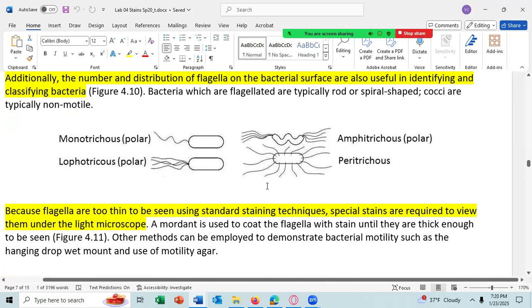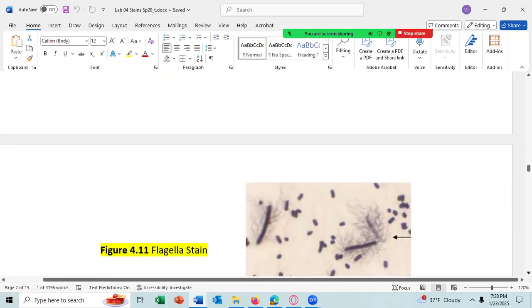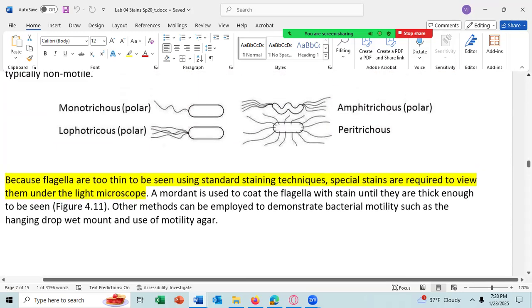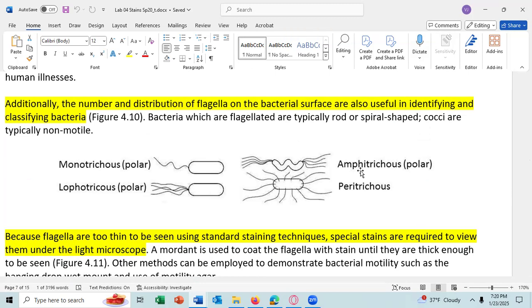So how do you name these? If in this case you see multiple flagella arrangements, which one do you choose? Anyone want to guess? I'll take that as a no, but actually you were going to say something. If you want to say it, go ahead. Predominantly, would we go with the lophotrichous just because it's the one we see most in the picture?